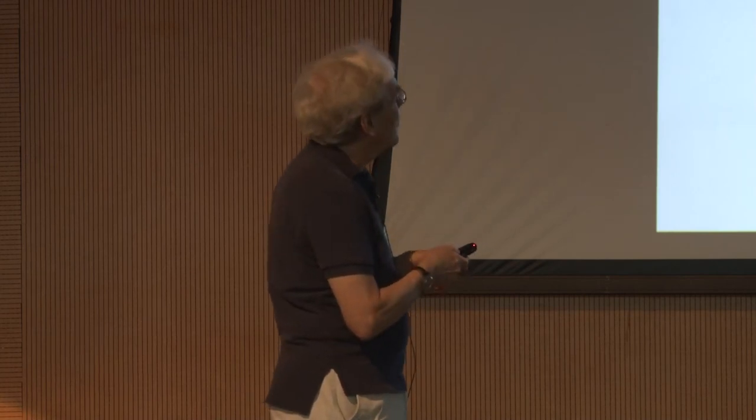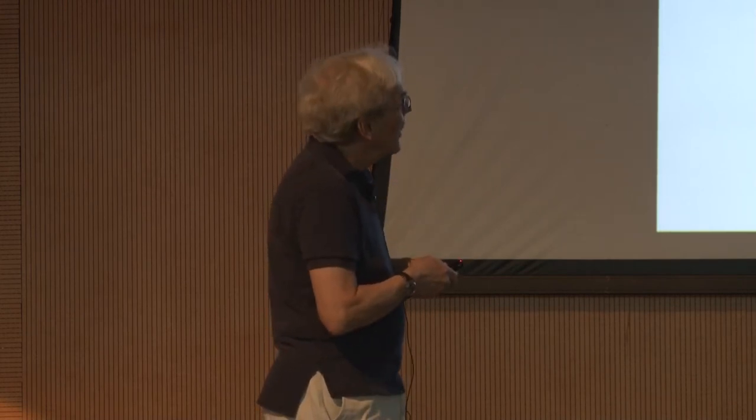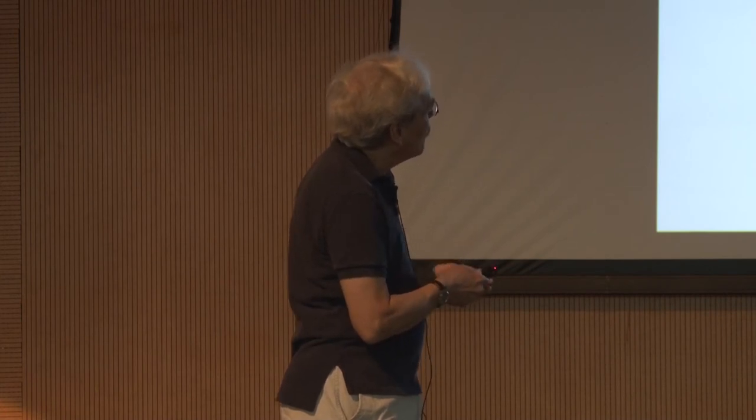And so then the second question, can you help with charging? I said there are charge fluctuations and charge buildup. Actually, Chris Russo and I have three papers just out in Ultramicroscopy. One is on the charge buildup, one is on the charge fluctuations, and a third is on something called Ewald sphere curvature, which is a 3D problem that has limited the resolution, but now no longer does. We've measured the charge buildup and the fluctuations, and they are measurable, but we don't think they matter if you do the specimens correctly. That's why this gap here, this green thing, is fairly small, and the charge buildup only happens at the very beginning. So we don't think that's so important.